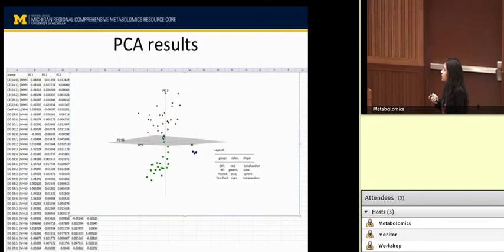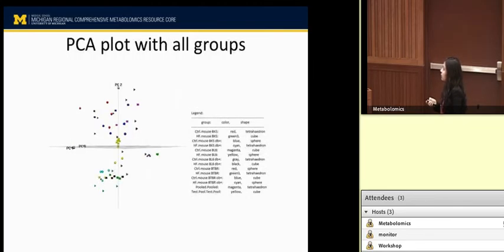And then with this PCA, we give all the loading information, both in positive and negative mode. This is another plot for each of the mouse types, that additional factor that we had here. Again, too many groups, just 4 samples, so we couldn't differentiate all of them, but still a good separation between the high fat and control mouse. So this is the extent of the basic report that we give to the clients with the preliminary data analysis.